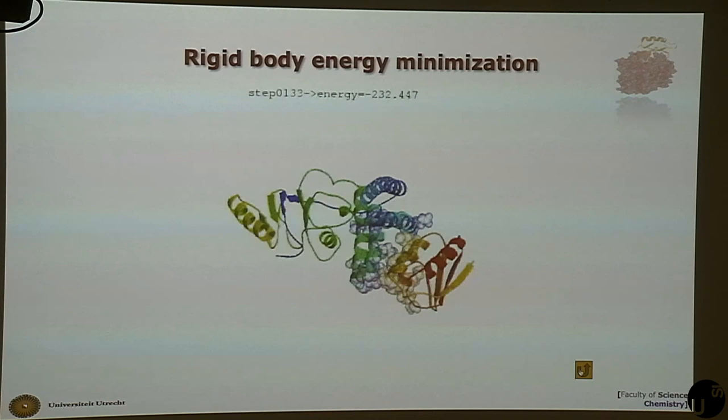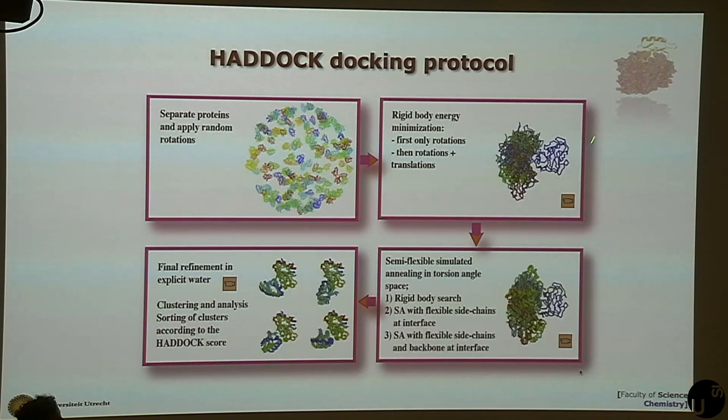And the result of that is, since we have information about the binding site, you see that these are 200 solutions superimposed on this blue protein here. So they all sample the same face of that protein because there were data pointing to that region, but they are oriented in all kinds of different ways because we don't have specific contacts defined. Okay, so this looks like spaghetti.